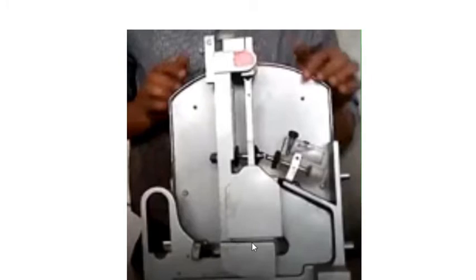This is the beam. This is the pendulum. This is the fulcrum. This is the dashpot. There is oil here for smooth movement of the beam. By adjusting the screw, you can adjust the speed or the loading rate. The loading rate can be set to 1 kg per second by adjusting this.